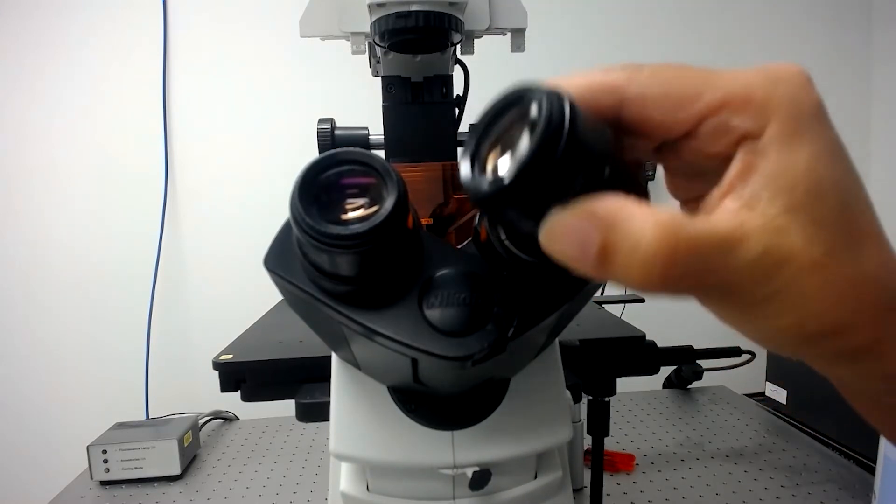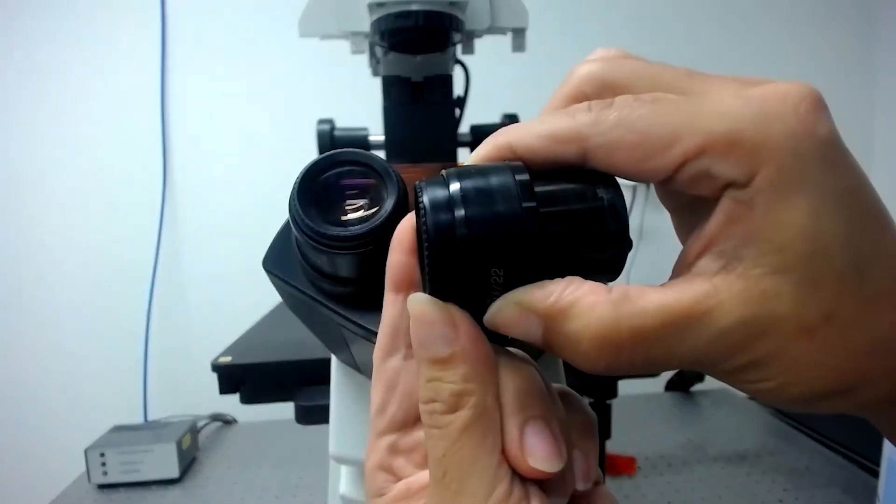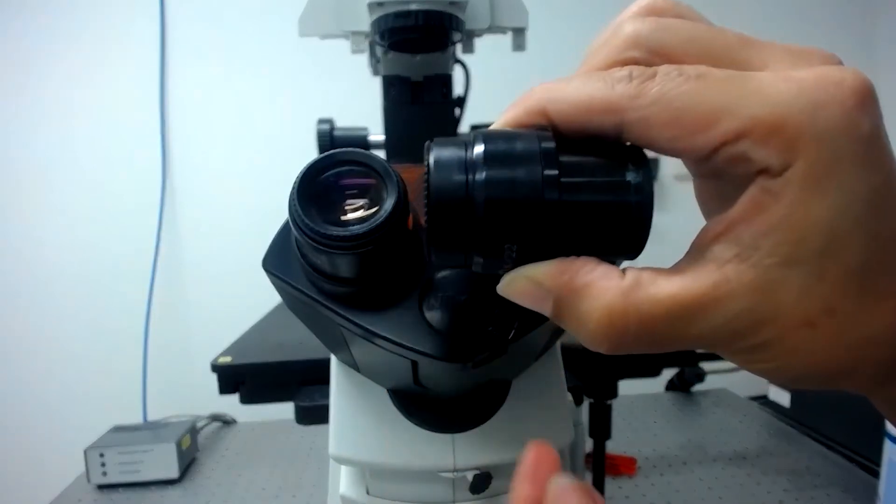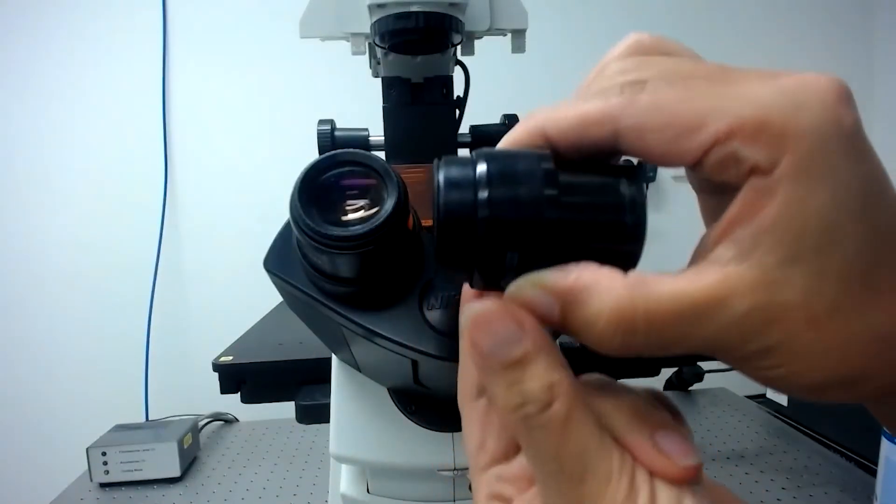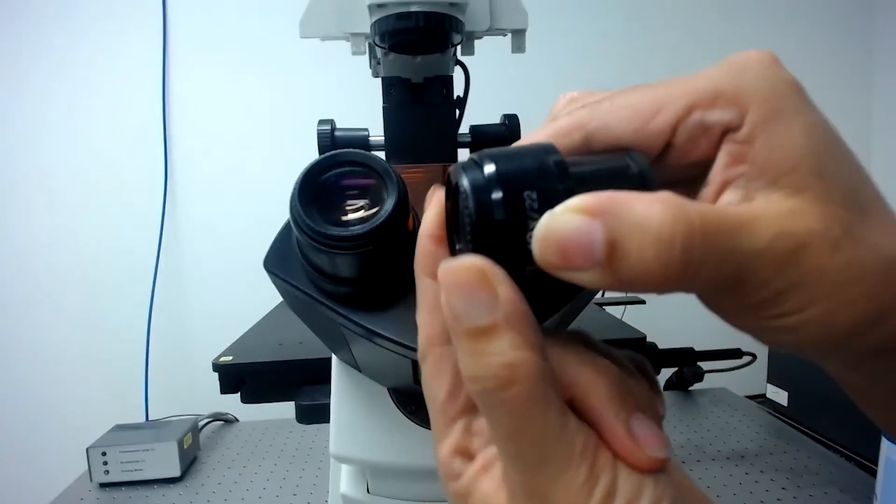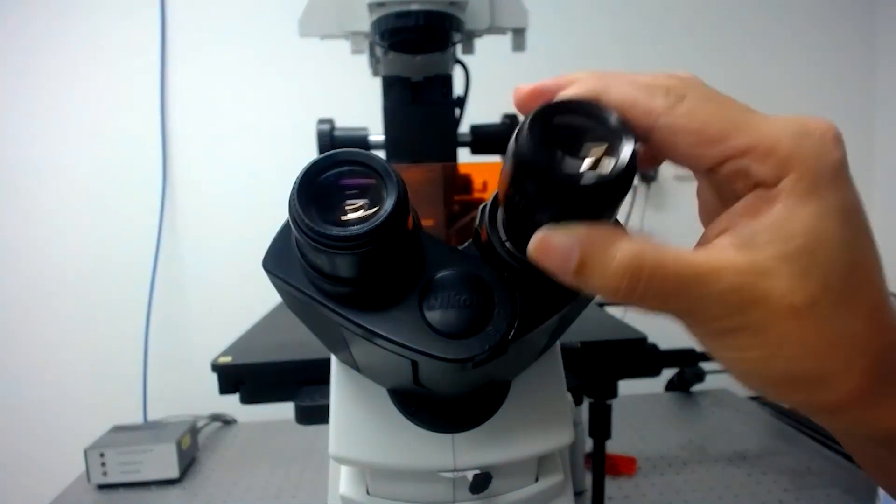Olympus and Zeiss generally use numbers to identify the diopter setting. However, Nikon utilizes an engraved ring to mark the zero position. Rotate the inner and outer housing until the ring is only just showing.